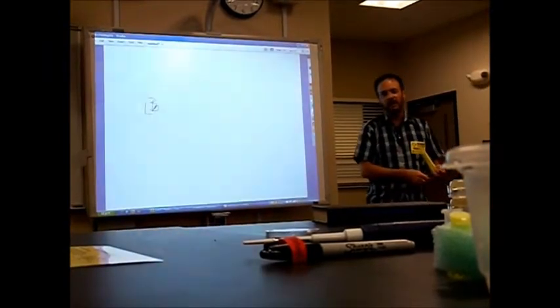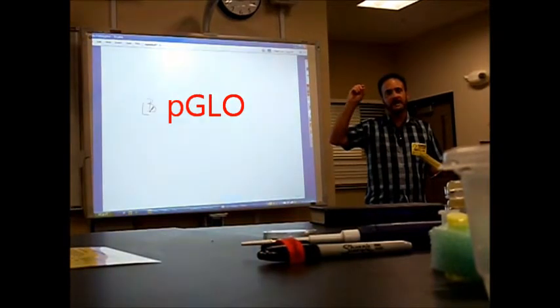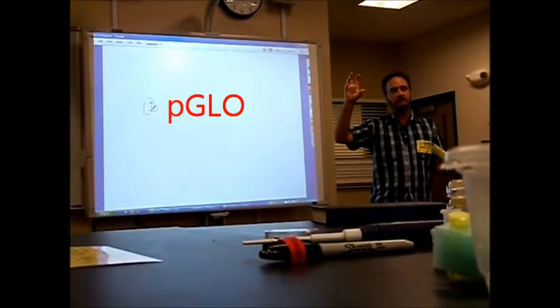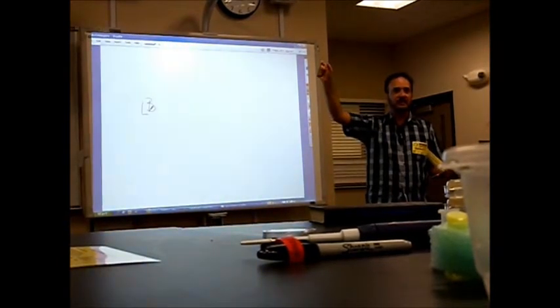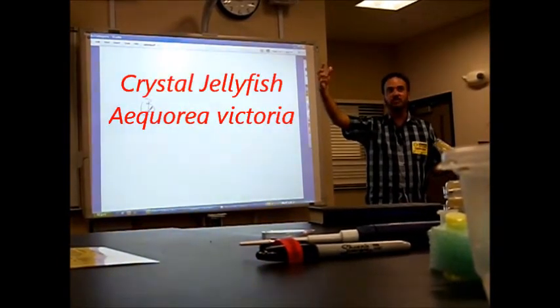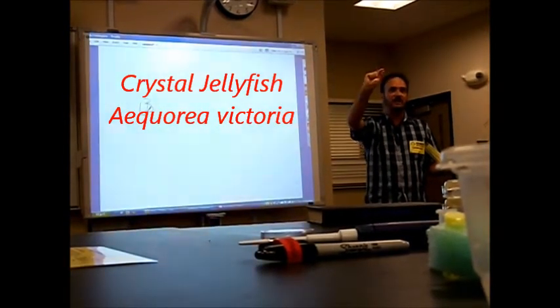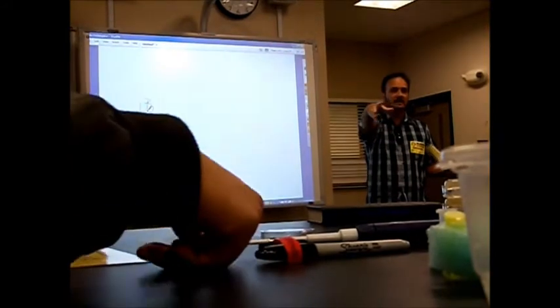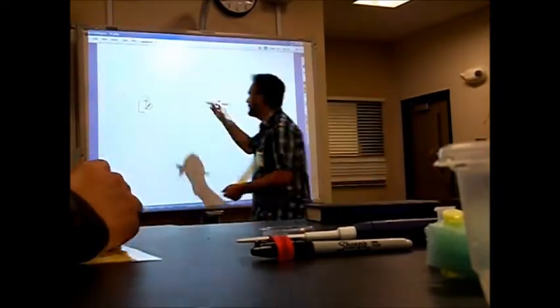So this lab is called, we're calling it a pGLO. The P refers to a little ring of DNA called a plasmid. And we call it GLO because that plasmid has been genetically engineered to have a gene, a little piece of DNA from a jellyfish. The jellyfish glows. You're going to take that plasmid that has the jellyfish gene and put it into living bacteria. And guess what? The living bacteria are going to glow. How cool is that? You won't see them glow today, but by tomorrow, if you do it right, you'll see them glow.